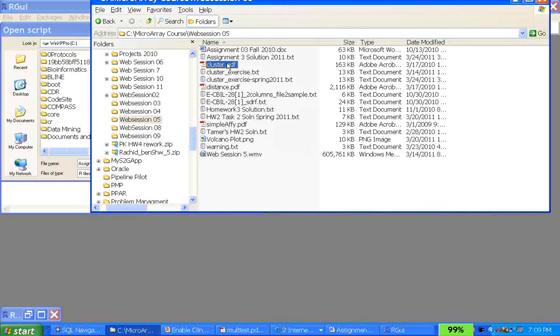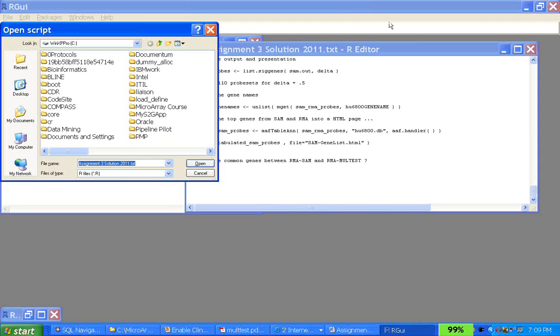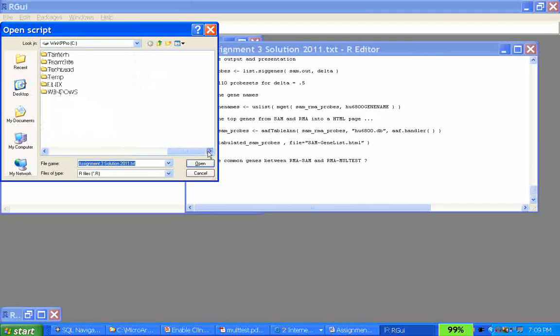You can go to your Blackboard and see all the 200 or 300 files I have uploaded. So read cluster.pdf and distance.pdf. If you read these two files, that should give you the fundamentals behind clustering. But in the course, we try to focus more on doing it hands-on through R. So I think I saved the cluster file here. Let me see.